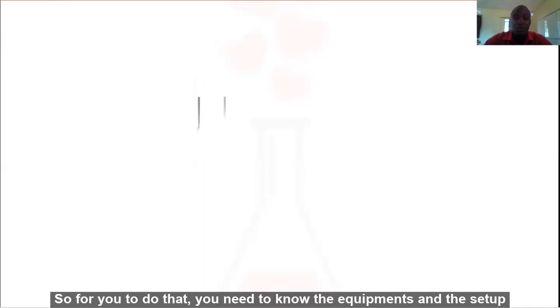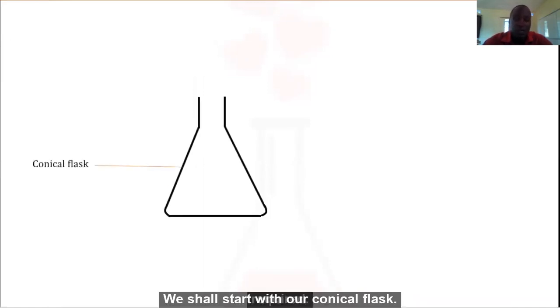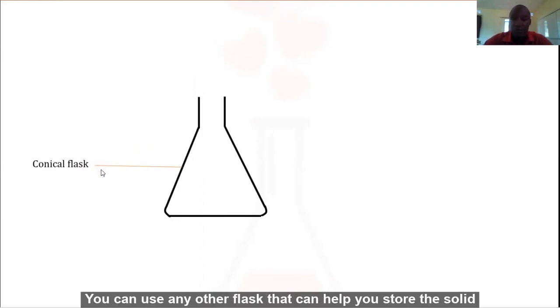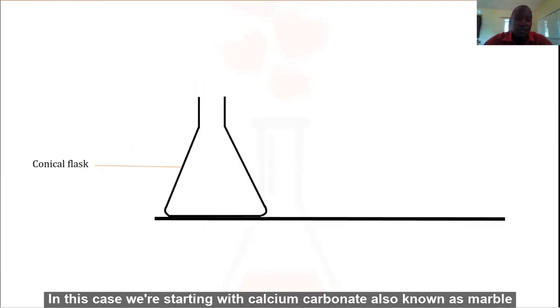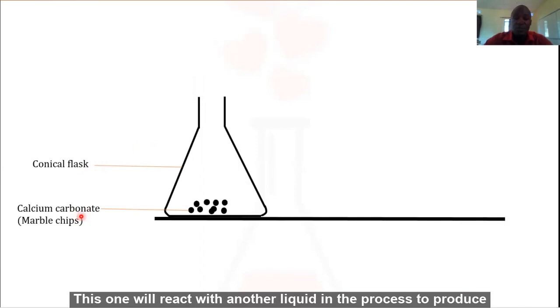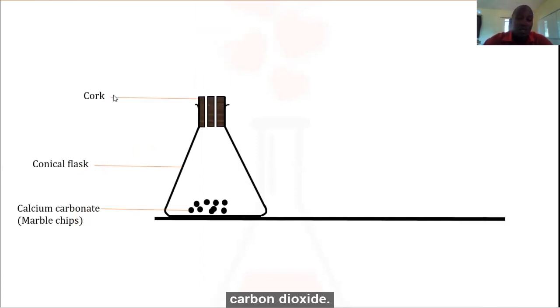For you to do that you need to know the equipment and the setup required. We shall start with our conical flask. You can use any other flask that can help you store the solid reactant. In this case we are starting with calcium carbonate, also known as marble chips. These will react with another liquid in the process to produce carbon dioxide.